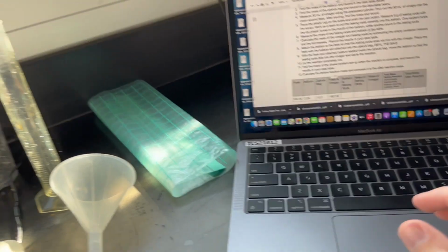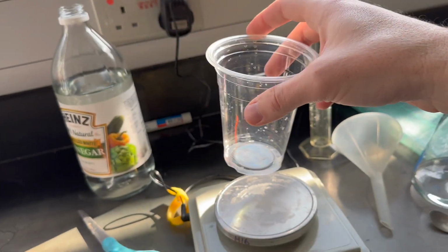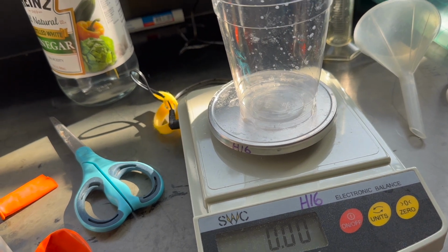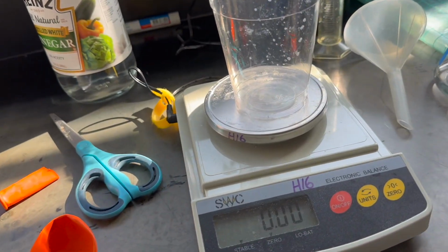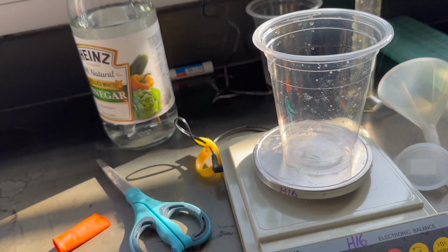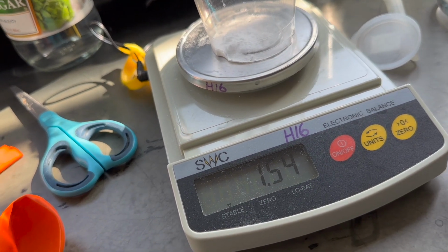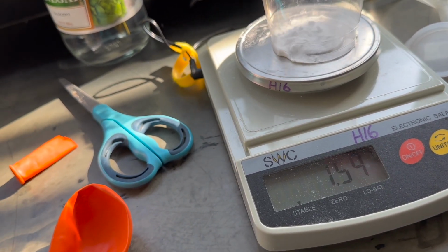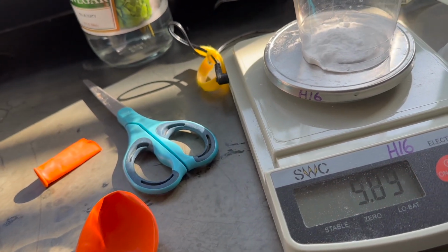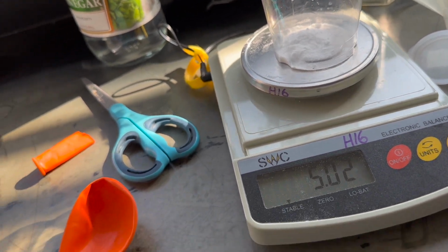Then we want to place the plastic cup on the scale. Zero it out and get 5 grams of baking soda. Ooh, that one was almost 1.5. 3.5. Oh, nice. 5.02. That's really good.